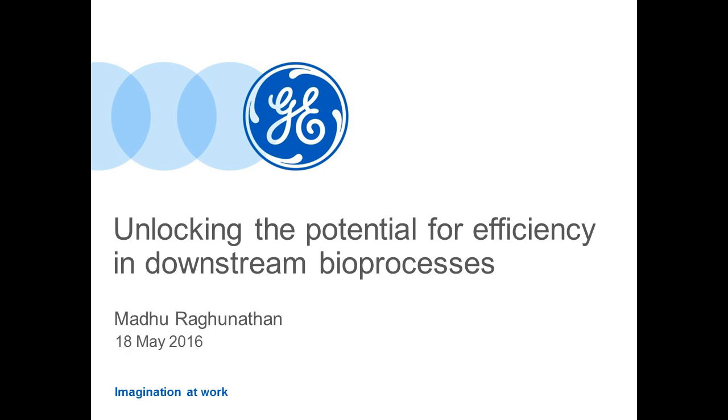The thing with the methodology is that when you use the axial compression methodology, more often than not it allows you to pack some of the modern resins, the ones which are more rigid. That's a really good starting point, and that's a constraint when you're using some of the other packing methodologies. For example, if you're using the pack and place methodology, there's a restriction in terms of what diameter and what bed height you can actually pack the modern, rigid resins.